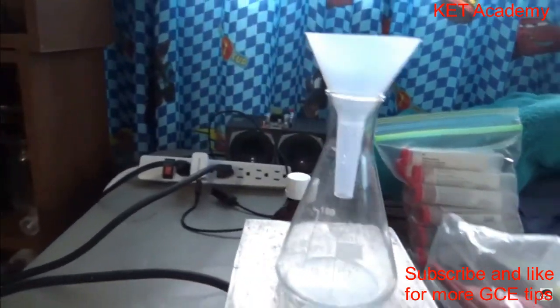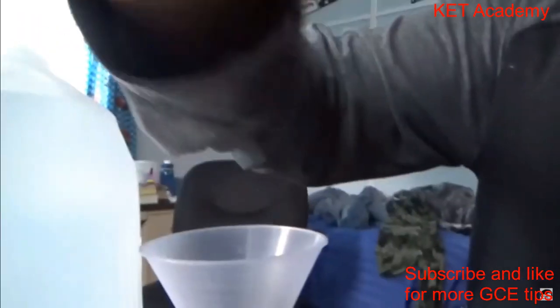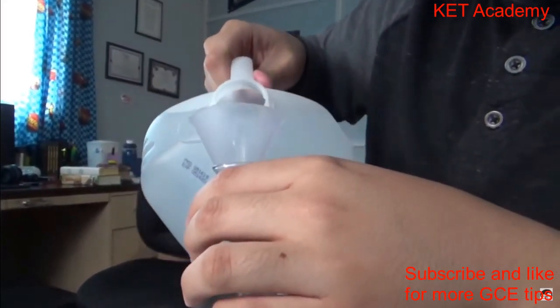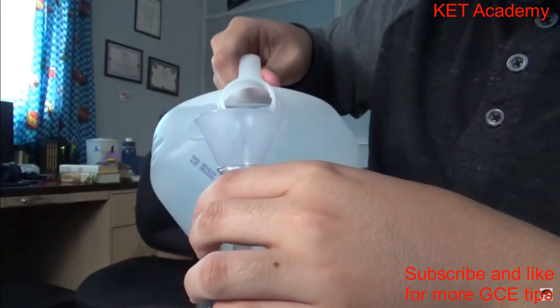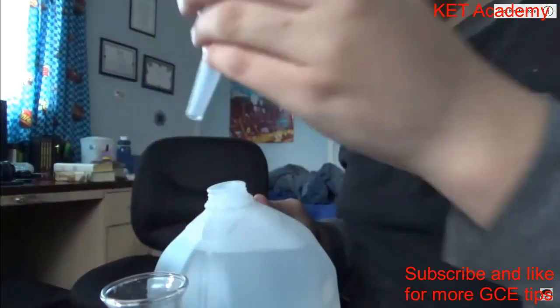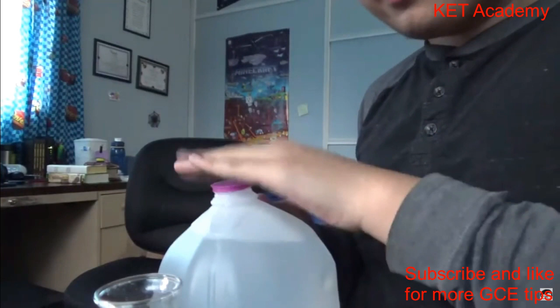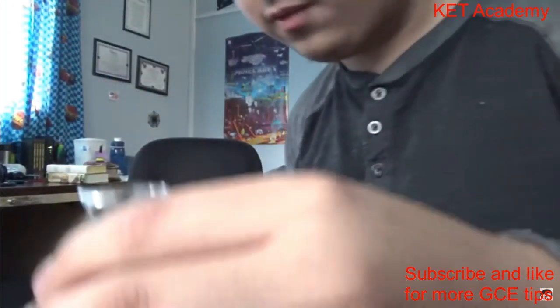And I have to pour this one-handed. I should actually, you know what? I want to set up the camera right there. Okay, water's going in. I've already taken the crystals out, so I'm fine with adding the water in there to dissolve all the rest of that.